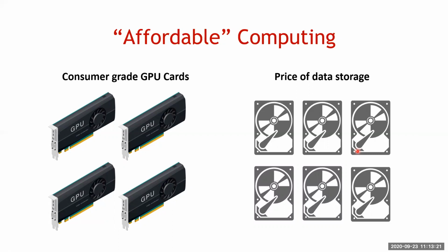And people were asking, why don't we use these cores to our advantage, as opposed to CPUs where the cores are in the tens, not in the thousands, as in GPUs. Basically it took a lot of programming to be able to utilize these cores. And now that we have them, it's easy to run these networks. In fact, there are cards out there made specifically for machine learning and deep learning. So that's pretty cool.